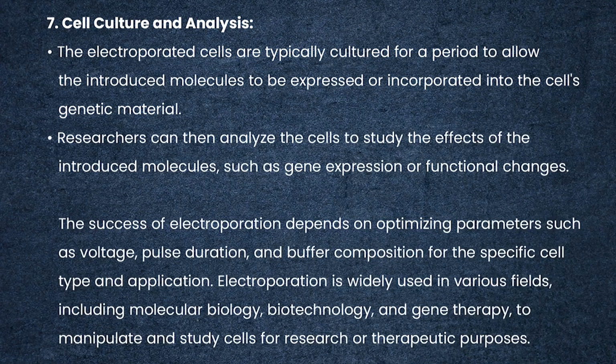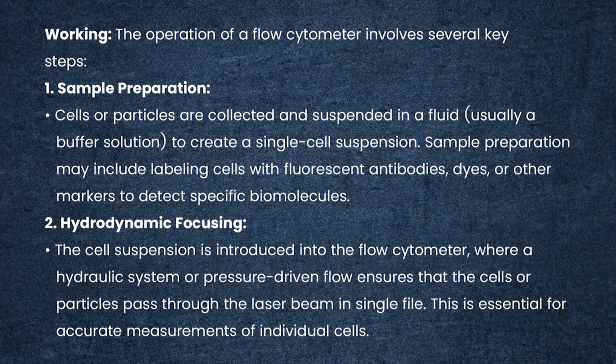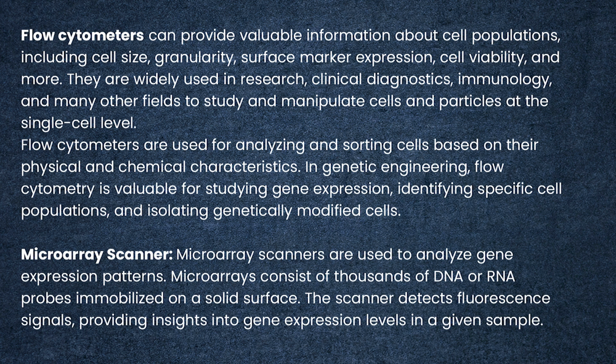Electroporation is widely used in various fields including molecular biology, biotechnology and gene therapy to manipulate and study cells for research or therapeutic purposes. So, the techniques that we talked about today are the basic techniques and the basic instruments that are used in genetic engineering in day-to-day laboratory activity.